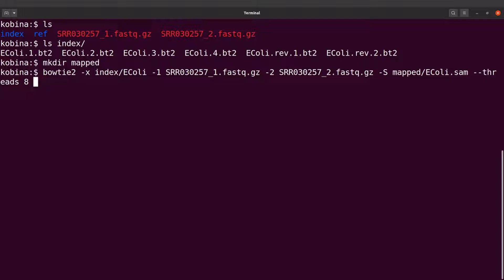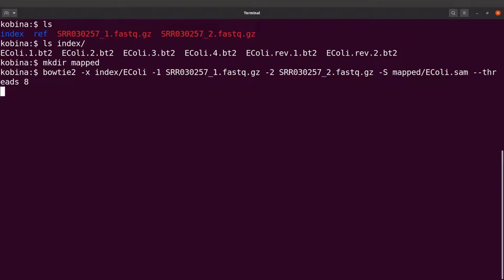Now we can run it, so let's do it. Bowtie 2 will start the mapping, so let's wait whilst everything has been done.